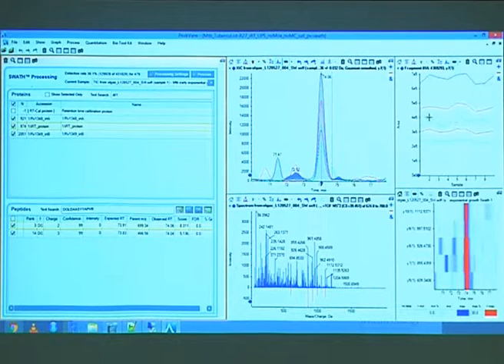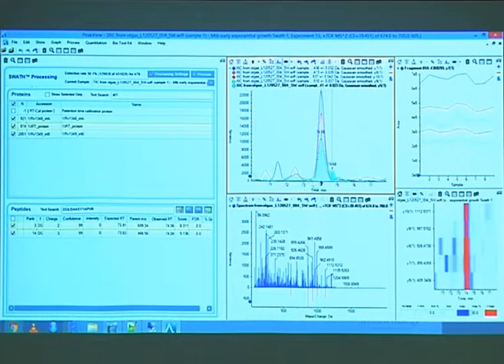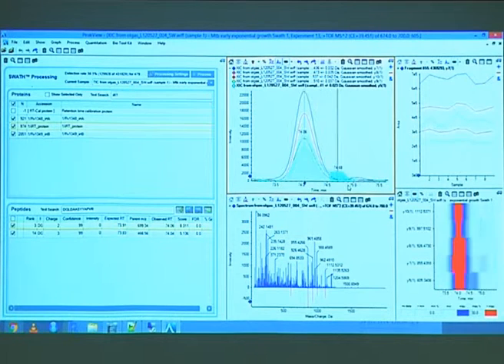If we go back to the first one, the one that's a bit lower, and now select this one, you see in this case the shading is different. So in that case, PeakView considers this a peak and this one here a peak. So that's why you see that little difference. It's also normal to see some fluctuation. You will hardly see them perfectly straight for all of them.